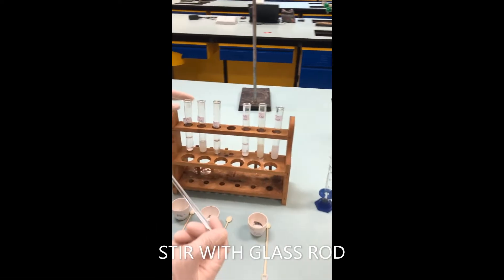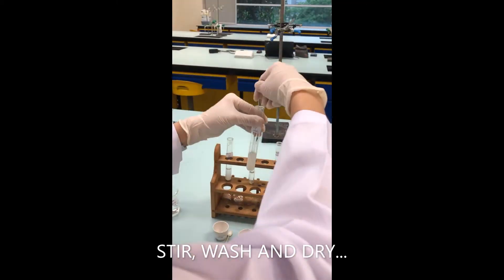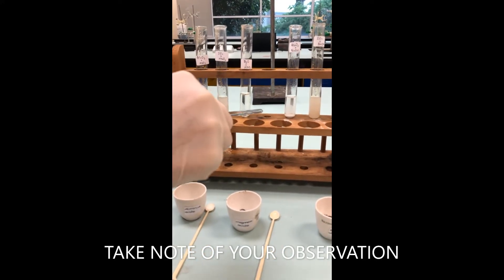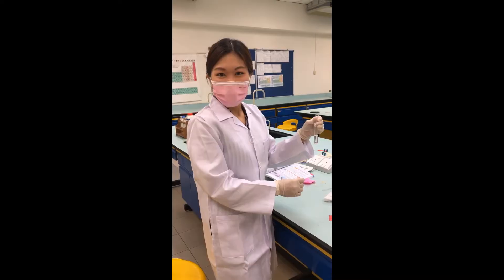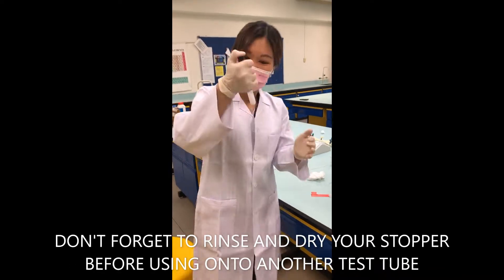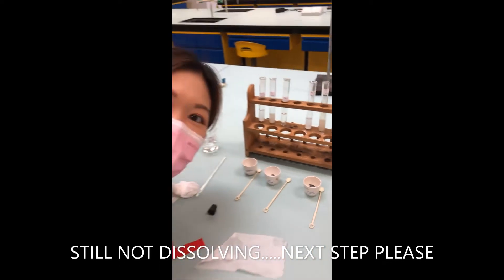You can stir the mixture with a glass rod. Some of these mixtures are not dissolving well, so we're going to try a second method — close the tube with a stopper and shake it rigorously to see what happens. Still no reaction, so we'll try the next step.